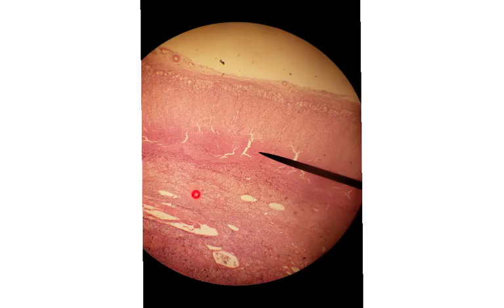But down here, I think, is probably the most obvious area. It's got these big open gaps. Well, this area is the adrenal medulla. Adrenal medulla produces the epinephrine that we've talked about all semester. This is a big part of your sympathetic nervous system. Remember that fight or flight response. But the adrenal medulla ends right here.